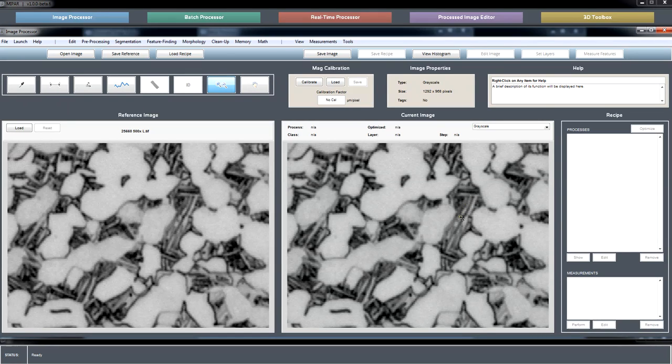These are low temperature precipitate phase with the high temperature parent phase in between, and this is an optical micrograph, so this contrast is surface relief and based on etching. So we've got surface relief at the alpha beta boundaries, which is why you've got these dark lines separating the features. And then I think in industry these are typically called secondary alpha, and primary alpha are these larger, rounder precipitates.